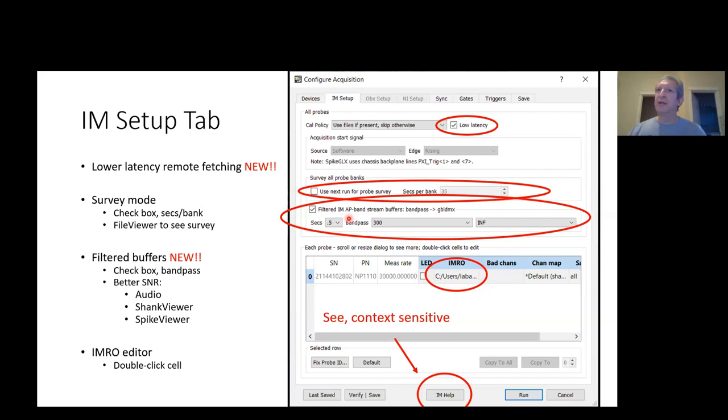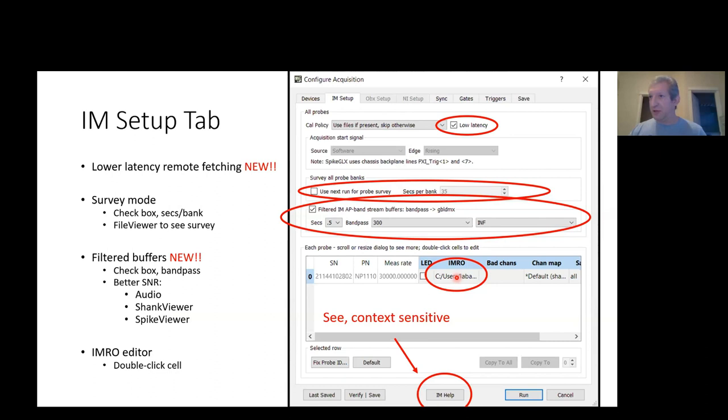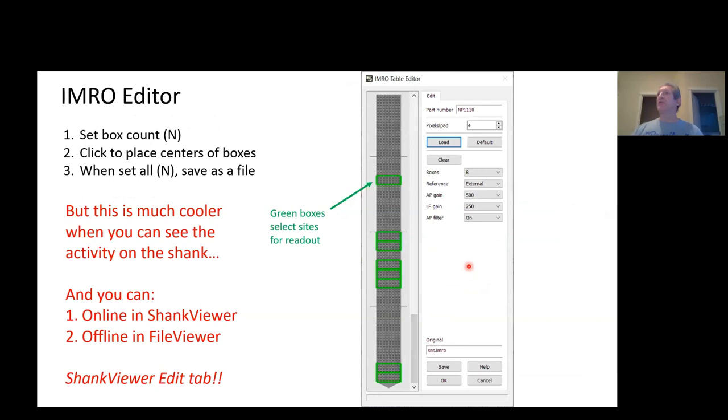Check this box to give every probe a history buffer that has your choice of bandpass filtering and has spatial filtering. These new buffers are going to be used to give a much better signal to background than we've had before for listening to spikes as audio or seeing the spike activity in the shank viewers and the new spike viewer. Now, you've learned already that there are many more sites on probes than there are channels that you can read out. To get to a selection dialog, choose those sites, you double-click under IMRO for the probe that you're interested in.